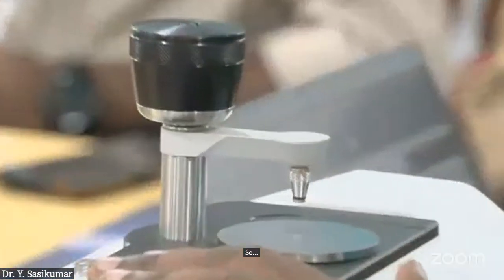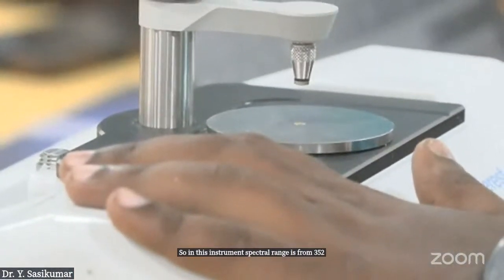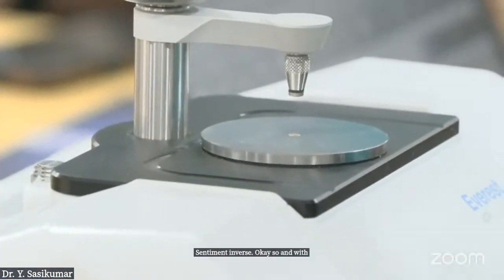This instrument's spectral range is from 350 to 8000 centimeter inverse, with a resolution of 0.5.